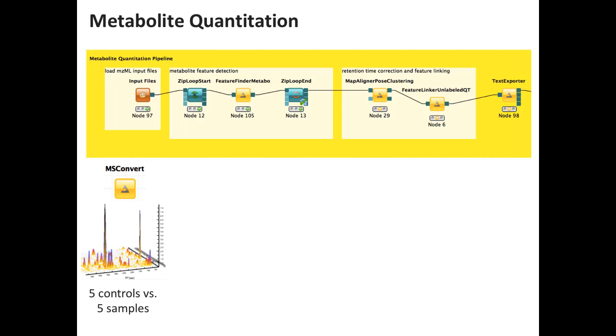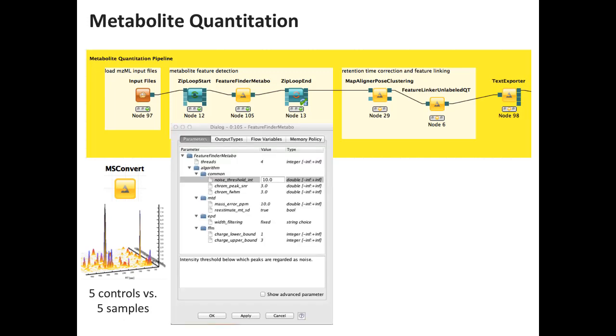And in the simple example here, we were running 5 controls and 5 samples, and you can look at the parameters of this feature finder. There are few parameters in here, and that is by design and not accidentally. We basically made the internal parameters dependent on 2 key parameters, and that is the mass error in ppm that you expect and the chromatographic peak width. There are a few auxiliary parameters, but that you usually don't need to fiddle with. But if you know how wide your peaks are, and if you know what the nominal mass resolution is, then you're fine with this particular algorithm.